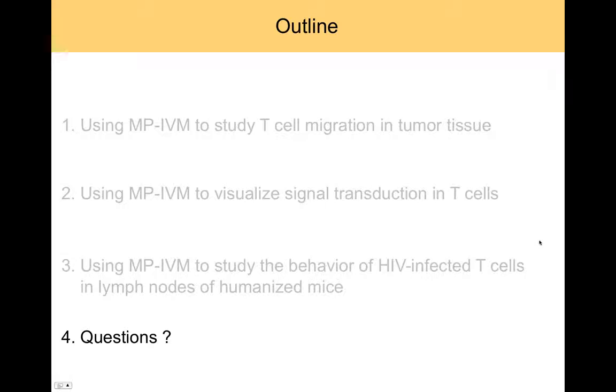Yeah, so I think in order to successfully use this technology, the best way is to start a collaboration with somebody who has a lot of experience with this technology, and that professionally uses this type of approach. And try to engage oneself as much as possible with the actual conduction of these studies in order to learn the ins and outs. And if, in the context of that collaboration, one finds out that the approach really helps you to advance your own science, at this point you can make the decision whether it is worth it to actually invest in getting the system up and running for yourself.